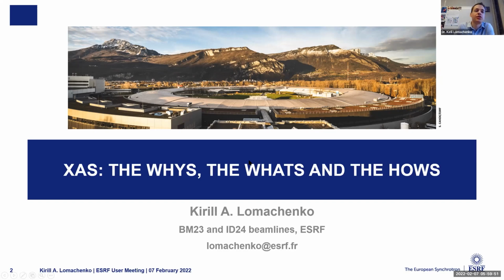So the chance to see lithium may be only in some very ordered matrix, when you have, I don't know, like 10 or 12 lithium neighbors of another element whose edge you measure. Then maybe you have a chance, but to see the difference between flow and no flow, I'm not sure.